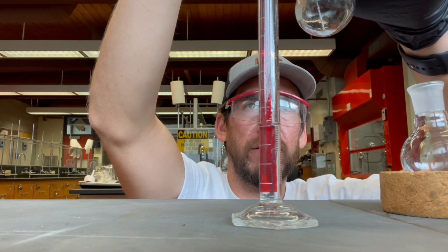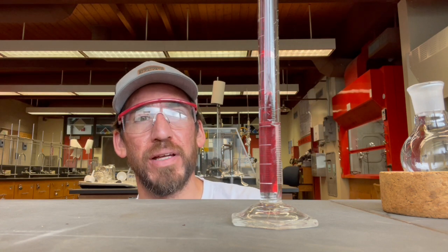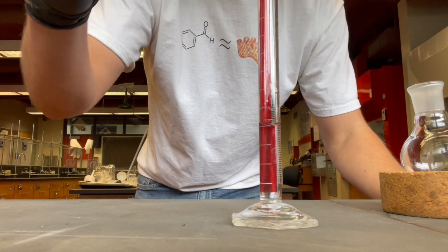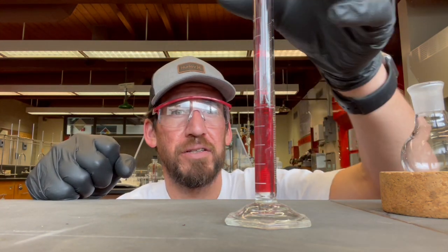I mean, we could take a look at the rest of that distillate, but you saw the density for fraction 3. And you saw that it wasn't very good. Oh, you know what? I forgot to get this stuff too. Pour that in there. Sorry, the final volume that we actually collected and analyzed was 5 mils even. And you saw that fraction 3's density was kind of all over the place because of the quality of the equipment, but it was definitely below 75% ethanol, which still isn't bad.